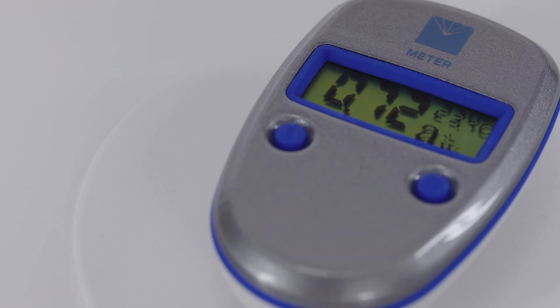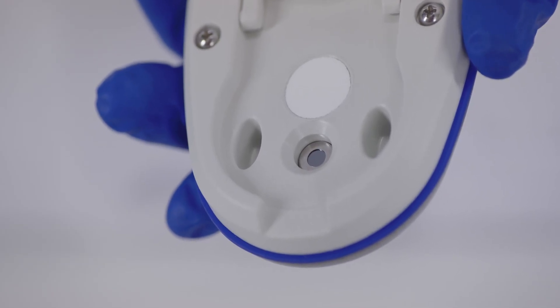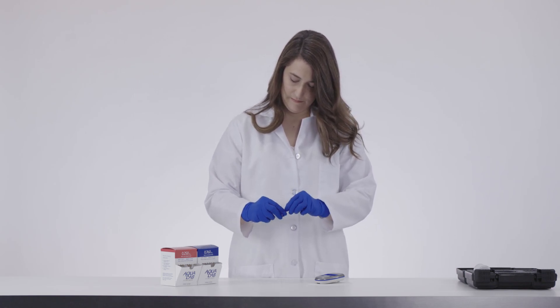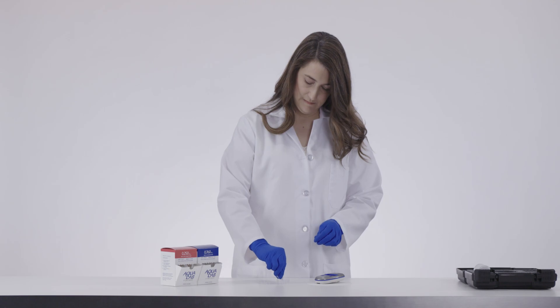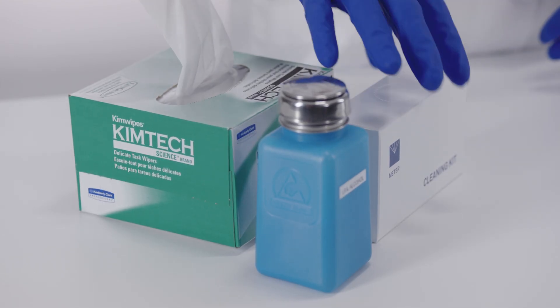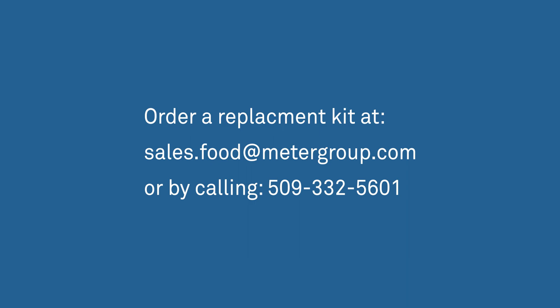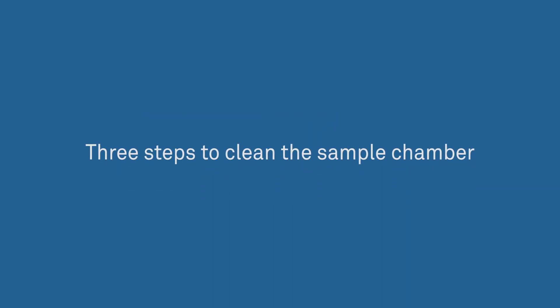Contaminants inside the sample chamber cause inaccurate readings and long read times. Contamination may or may not be visible. The best way to check for contamination is by verifying your instrument with the standards at the start of each day. If your verification standards read out of spec, the issue is almost always chamber contamination. Follow these cleaning steps and retest the instrument to resolve the problem. A cleaning kit is included with your pocket. If you run out of cleaning supplies, you can order a replacement kit at sales.food@metergroup.com or by calling 509-332-5601.